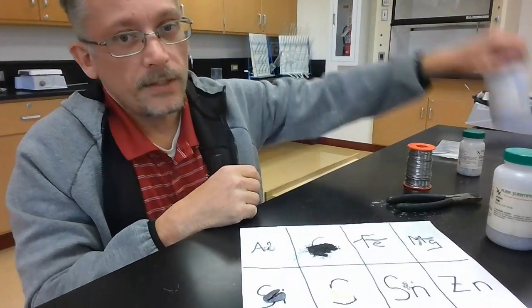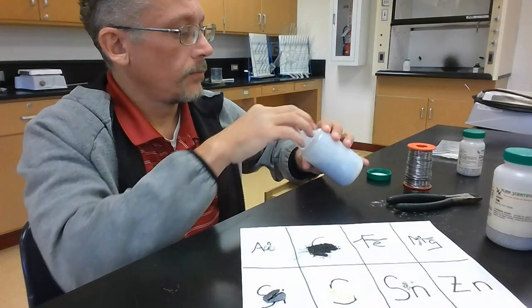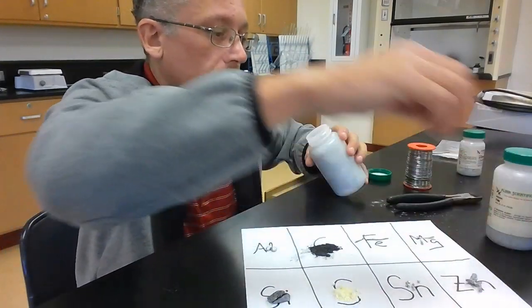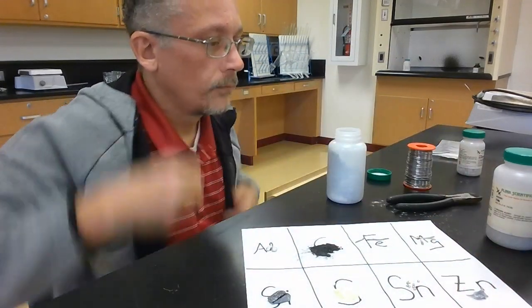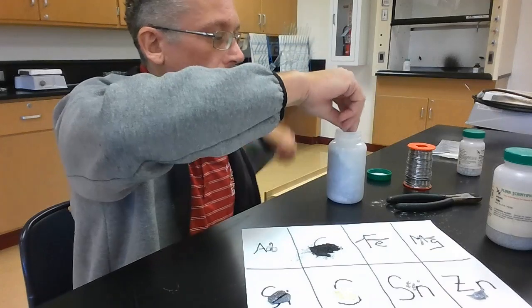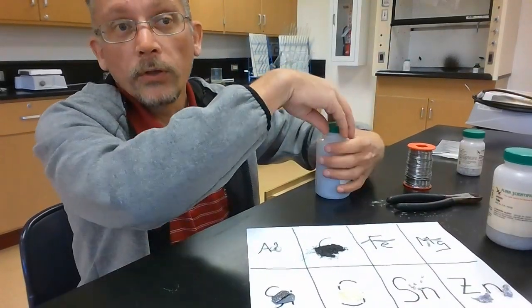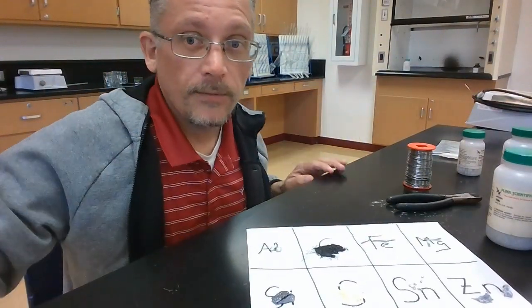And here's my zinc. Pieces of zinc here. Okay, so now we've got our elements. We're going to go ahead and test first their conductivity.